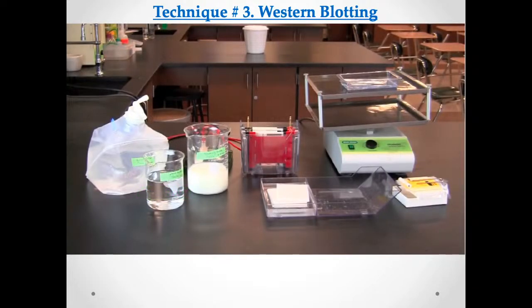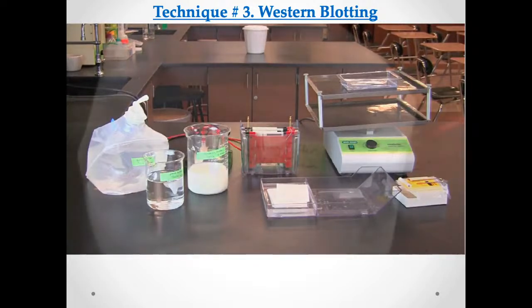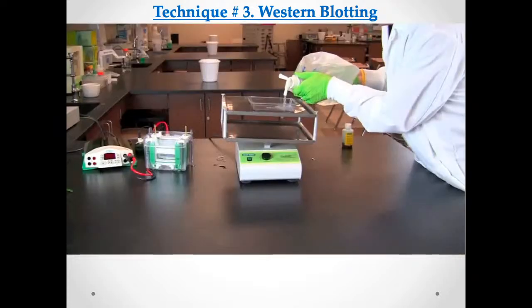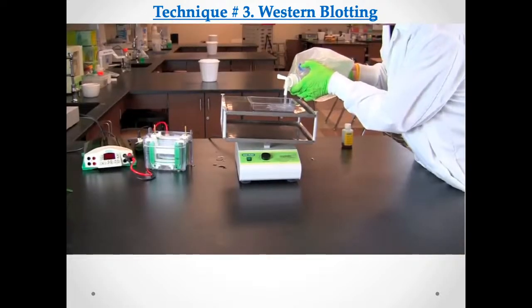In this video, you will learn how to perform a Western blot. A Western blot can be used to identify specific proteins in a sample and provide information about the protein size and relative abundance in the sample. First, fill a tray with blotting buffer. You'll be using this buffer to equilibrate your gel prior to starting the Western blot.